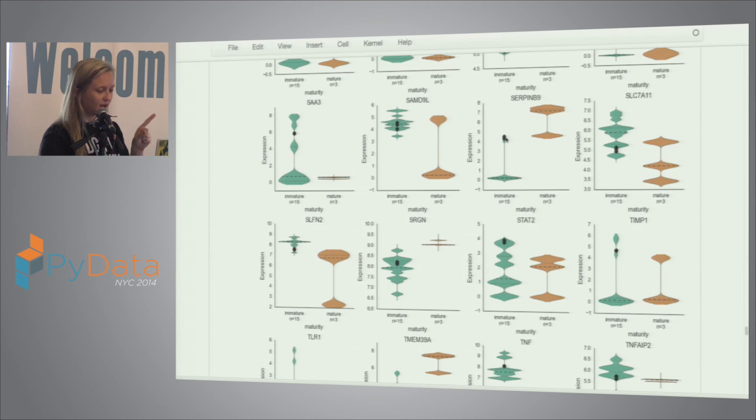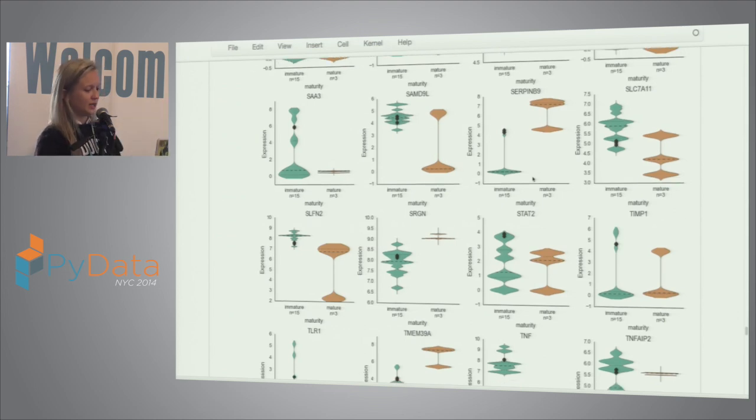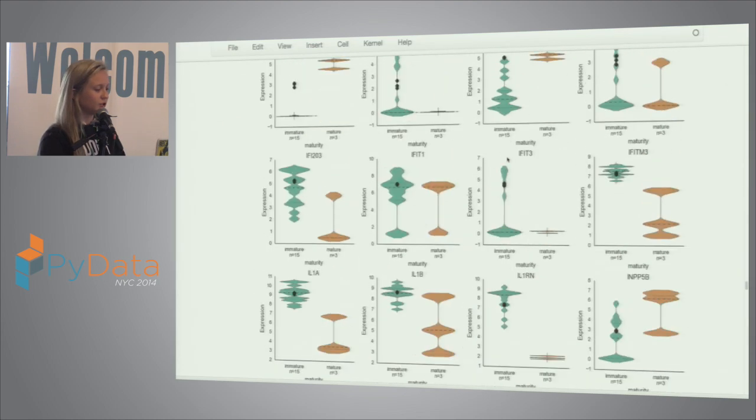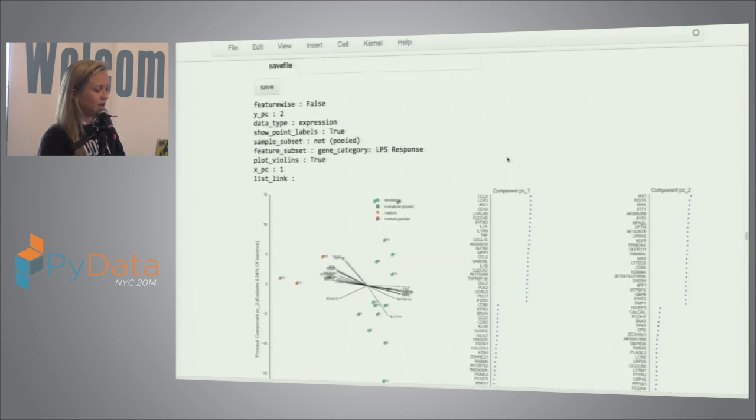Oh, and I should mention that these black dots are the pooled samples. The pooled samples do not always exactly represent the single cell, so this just further emphasizes that. This can be a really great mental model, especially for the biologists I work with, because the PCA can make sense, but what happens to the genes and the expression itself can be not quite intuitive.